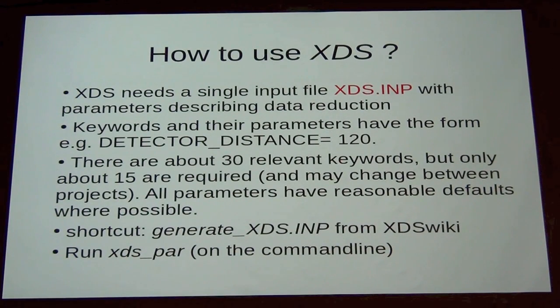Then you run XDS or the parallel version. But usually you had to type this on the command line. Now the GUI takes this task away from you.